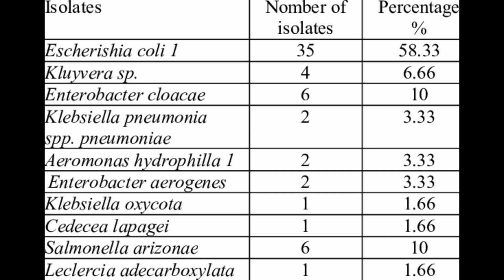It can detect three properties of the enteric. It is the motility, since it is semi-solid. It is the indole, if you add Kovacs reagent after incubation, and the ornithine decarboxylation. With a wire needle, get the inoculum and stab the butt once all the way down to the bottom. Then incubate. During the incubation, glucose is utilized producing acid. The MIO will turn yellow.